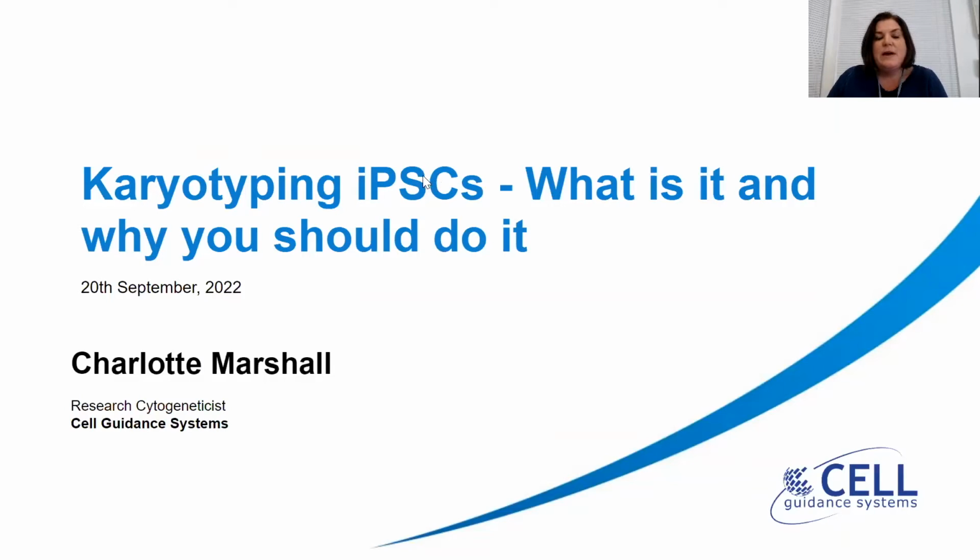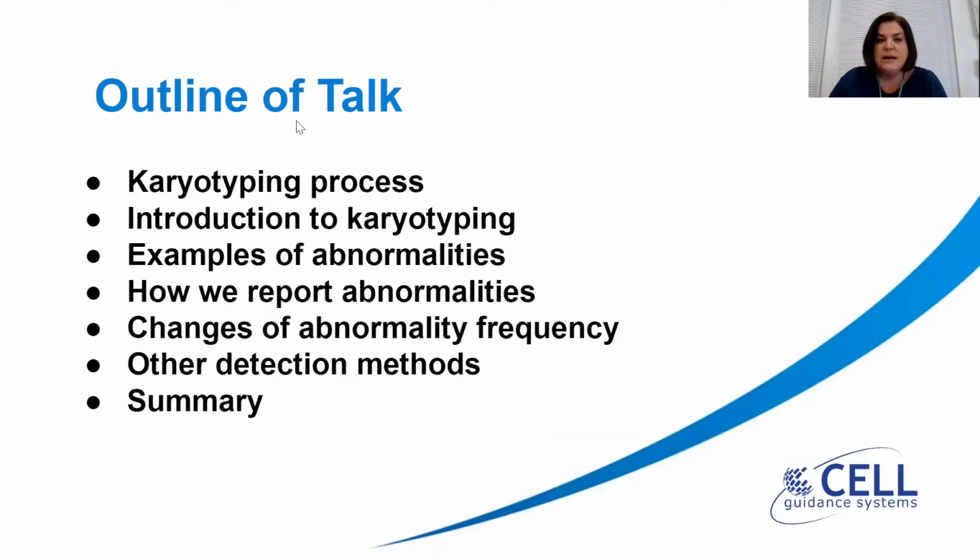Today we're going to talk about karyotyping of induced pluripotent stem cells, what it is and why you should do it. So, an outline of today's talk. First of all, we're going to talk through the karyotyping process. I'm going to cover an introduction to karyotyping, discuss examples of abnormalities, discuss how we report abnormalities, mention changes of abnormality frequency, and discuss some other detection methods.